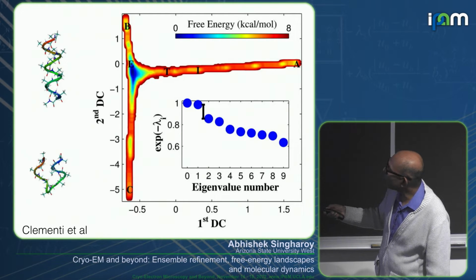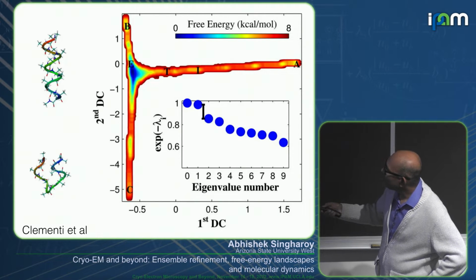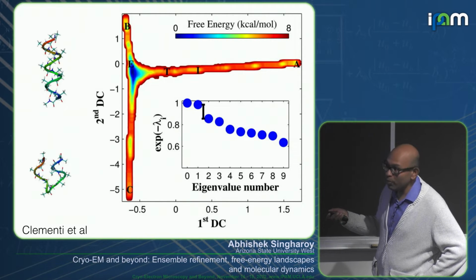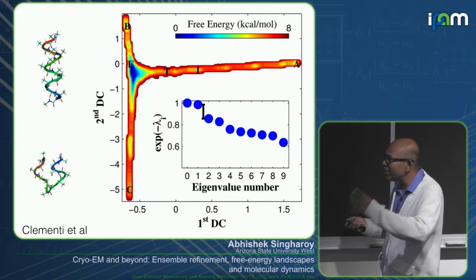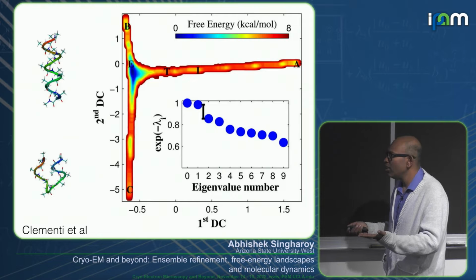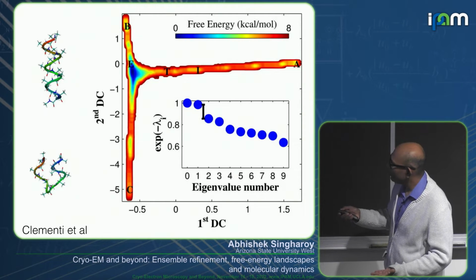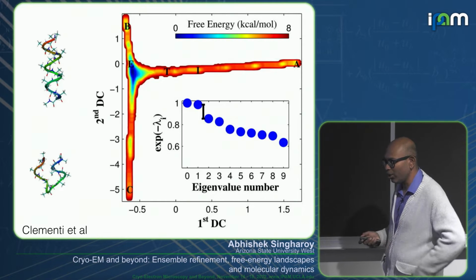And what they find is, this is a simple 12-alanine example. Even here, this gap is so small. If you go to bigger systems, maybe the gap is bigger, but you don't know. In traditional use of diffusion maps that has been published, these truncations have essentially been brute forced to the first two, and they're gone.